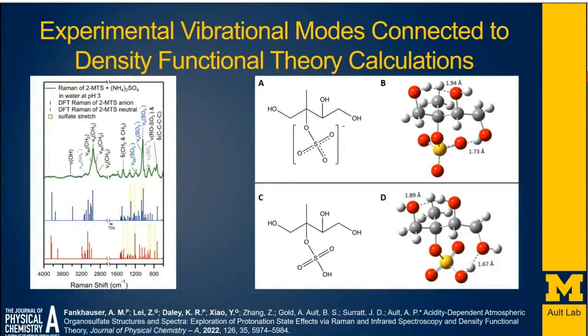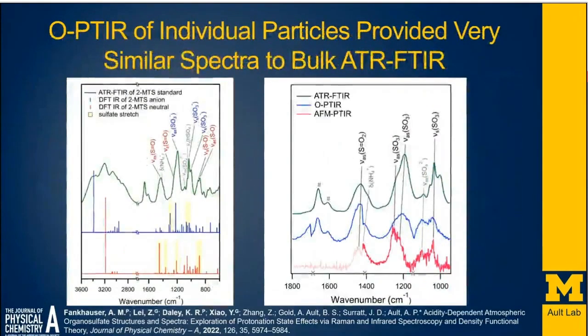And so here, we've known the Raman peak for these organosulfates was roughly in the 1075 wave number range, but we didn't really know where the IR was, and that's where we were excited. And so we took some of our pure sample and looked at it with your workhorse ATR-FTIR, but it takes a bit of material, and it's not actually what's in the aerosol phase, right? It's just what we're getting from the synthetic products.